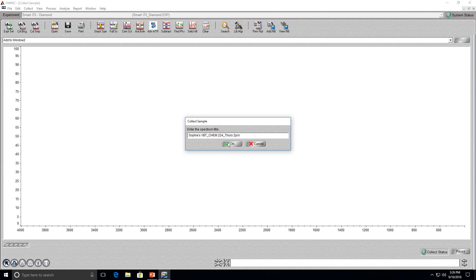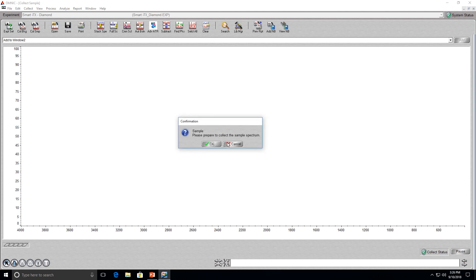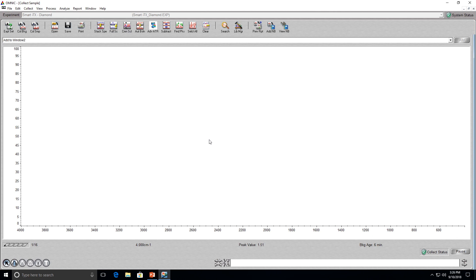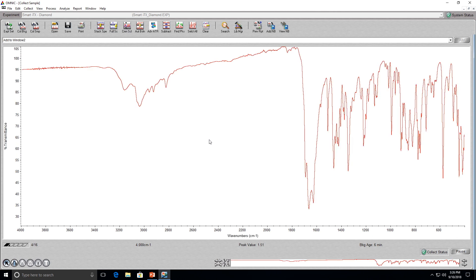Another box will pop up asking you to check that the sample is ready. Click OK. From there, the instrument will start taking the 16 scans required for the spectrum. After 4 to 5 scans, the spectrum should appear on the screen.